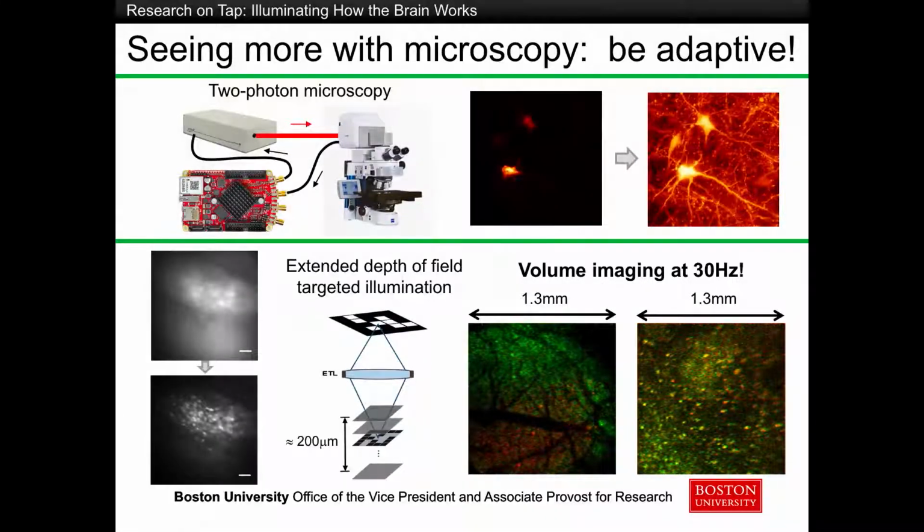In other words, as you're scanning this laser focus, you can change the laser power so that you only deliver laser power where and when you need it, and you go from this to this. We've just increased our dynamic range by 16,000 in this particular example, and it's a pretty good deal. This little electronic add-on costs $500 compared to this $500,000 instrument.